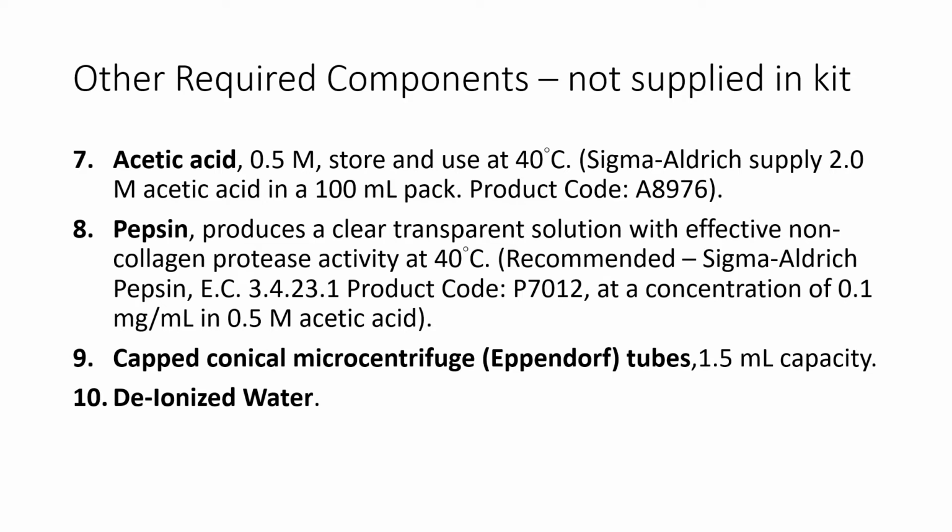There are other agents that can also digest collagen, such as the enzyme collagenase, but pepsin in particular has been recommended with the Sircol assay kit, and so that's what we're going to use to digest the soluble collagen.